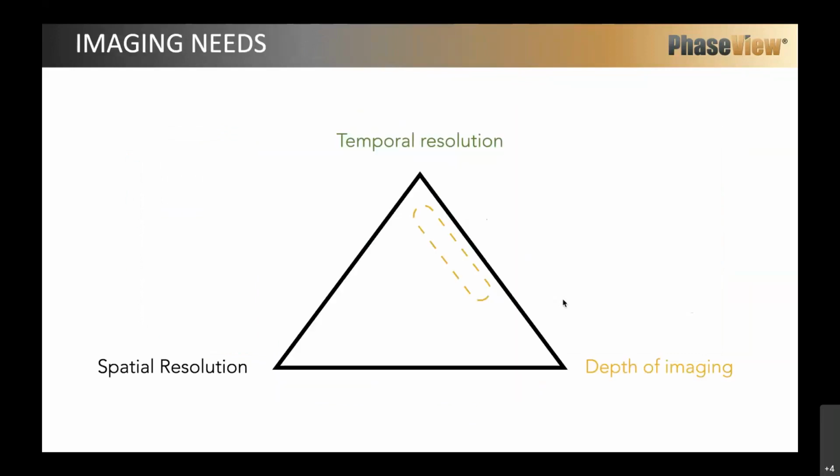So maybe it's what you want. You need temporal resolution and depth of imaging. So basically what you need is 3D over time, and you want to have the shortest time step possible for your time lapse. When you need that, you can use the spinning disk. But today I will present to you light sheet fluorescence microscopy. I will show you how you can do 3D images with a high number of slices in your stack and have a high temporal resolution.